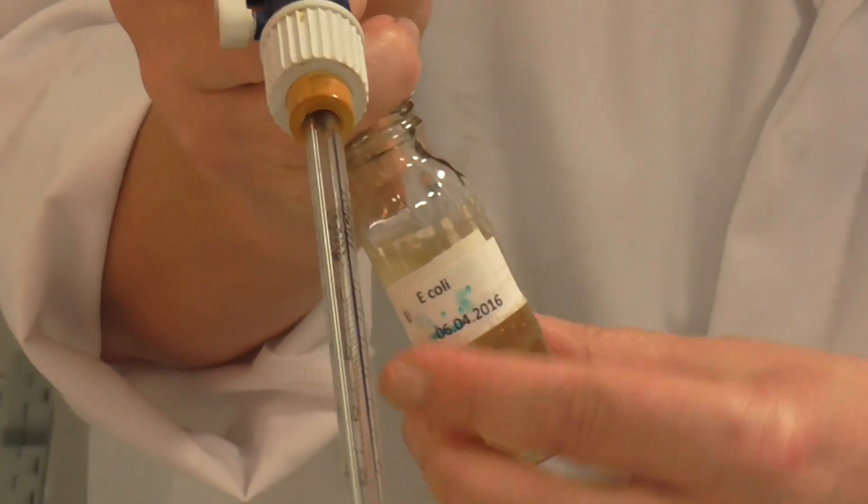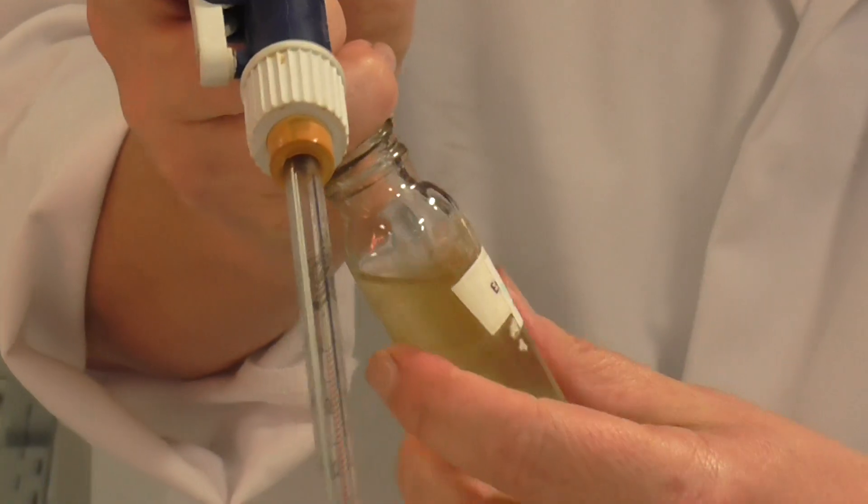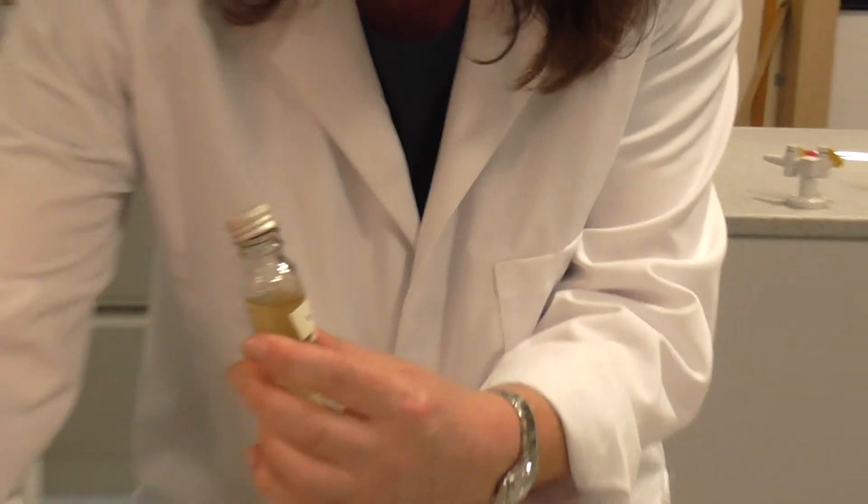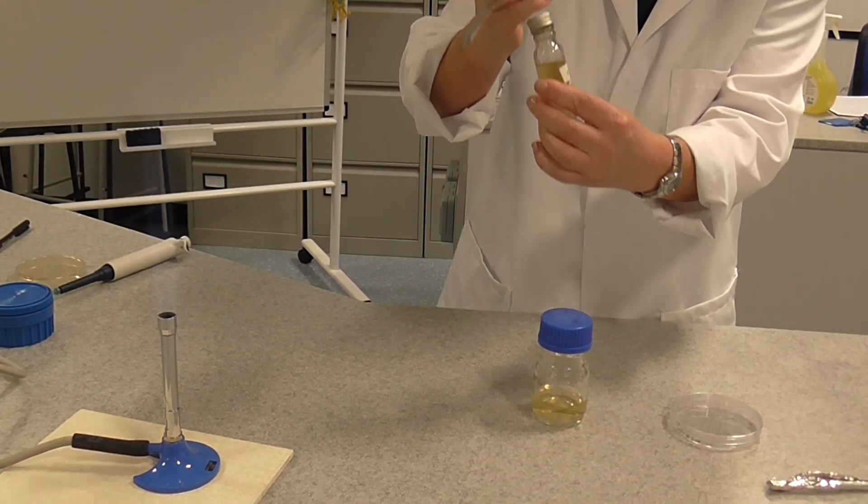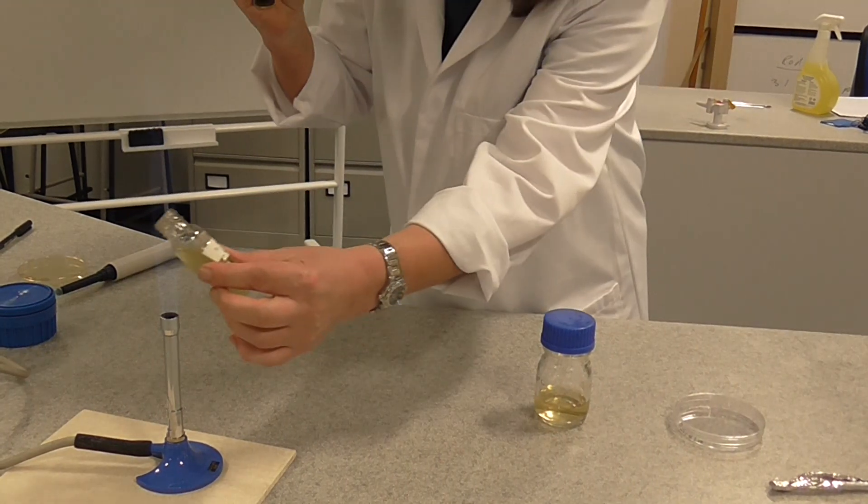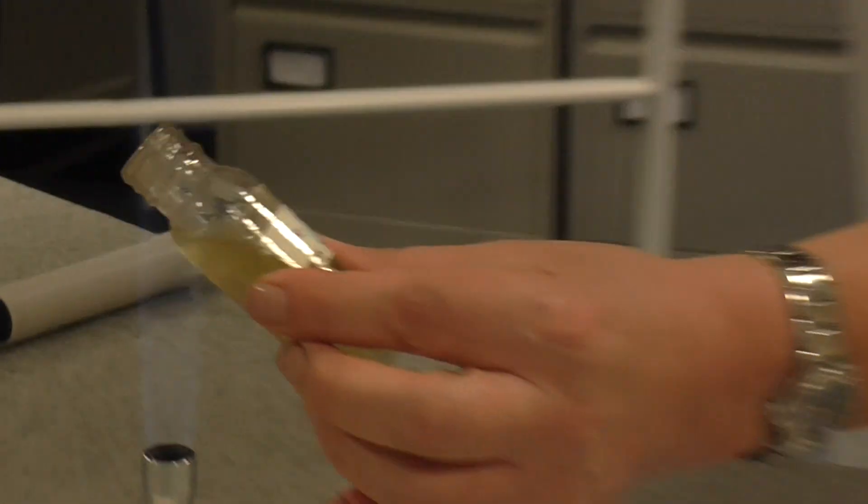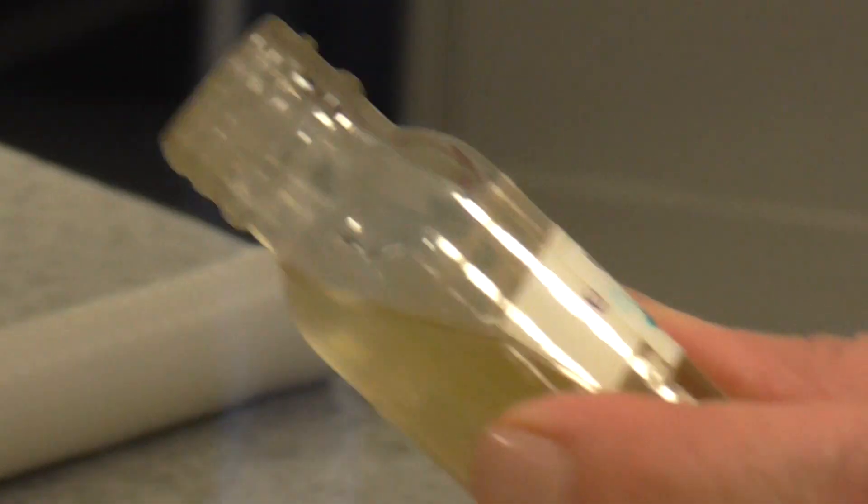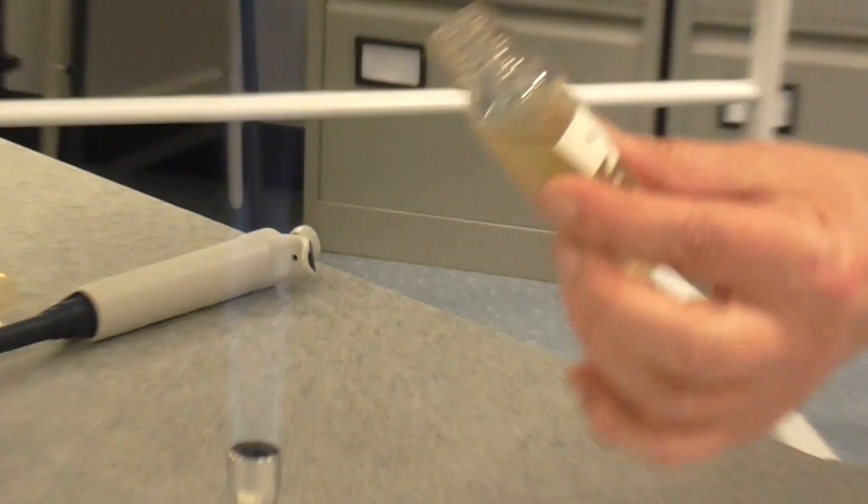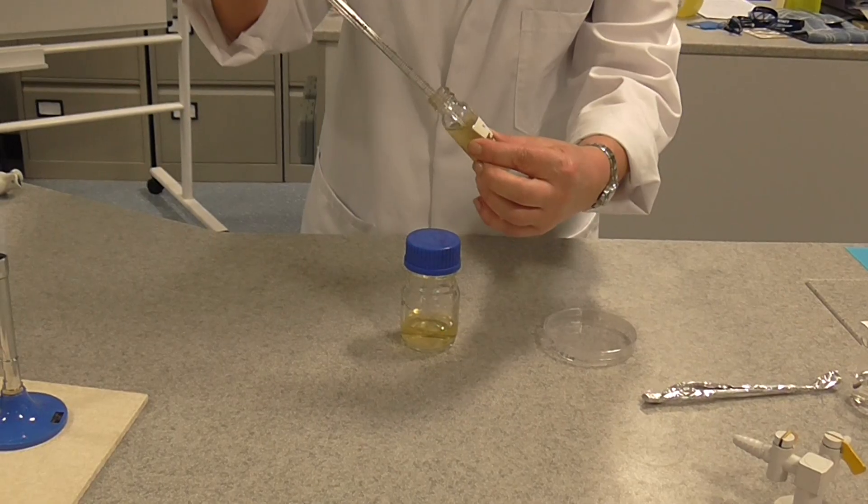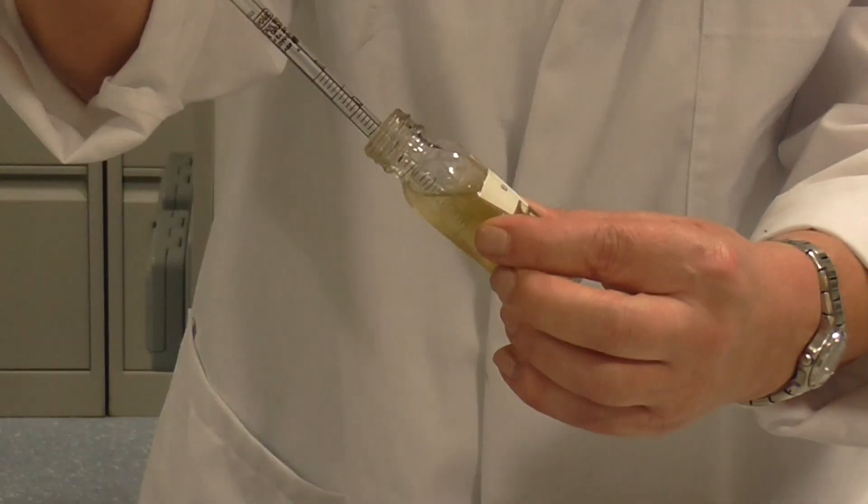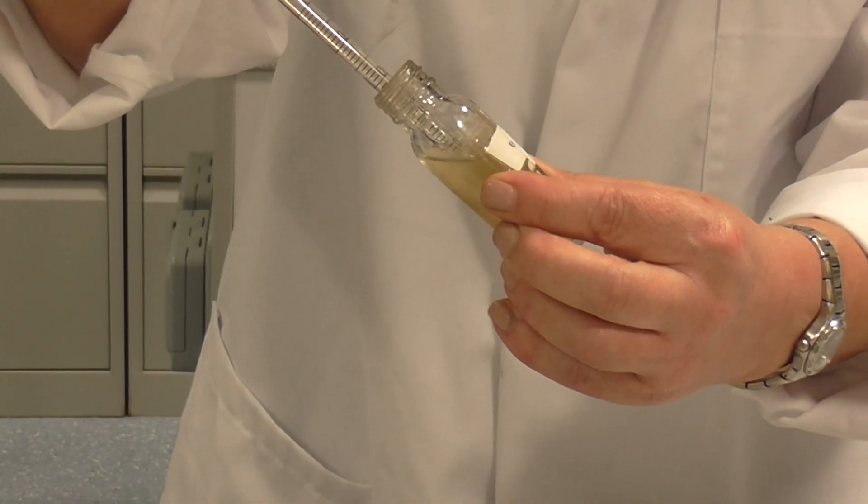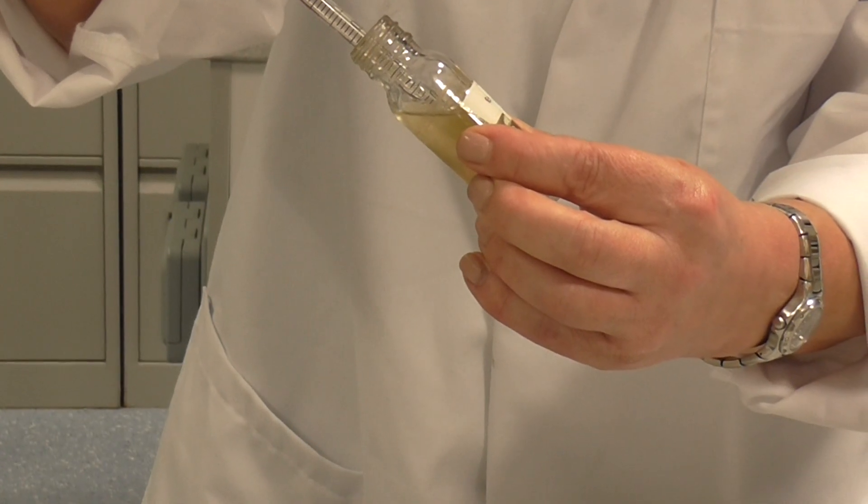We're going to put the flame on hot and we're going to flame the top. This is to kill off any bacteria that might be on dust that's getting into the neck of the bottle there. The next thing I'm going to do, I'm going to withdraw exactly one centimetre cubed of bacterial suspension.